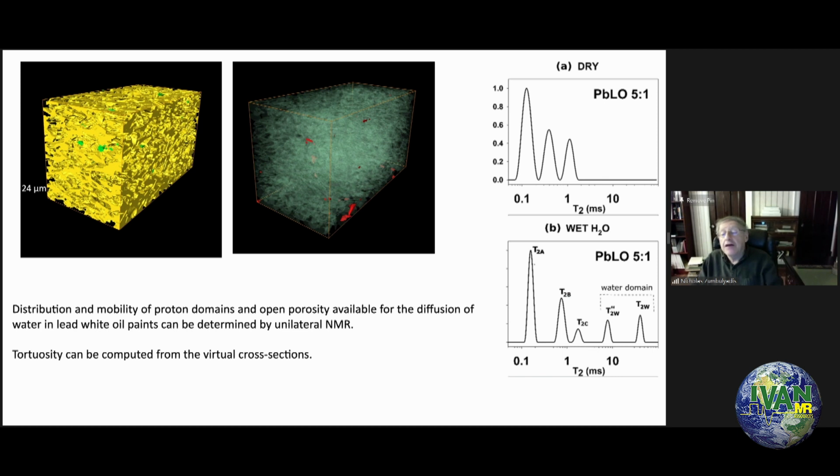You can correlate that with the NMR mouse results. In a dry sample, you see the three peaks that I mentioned to you, the three motional regimes as resolved by the inverse Laplace transform technique. What you see here is probably the backbone, according to Valeria. This is the chain ends, and these are the dangling chains, being the most fluid.